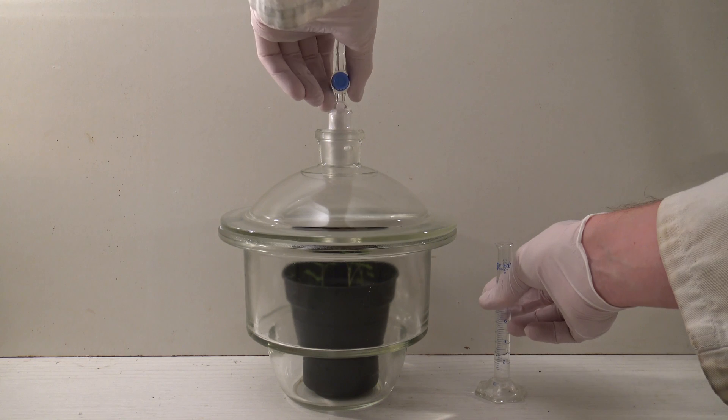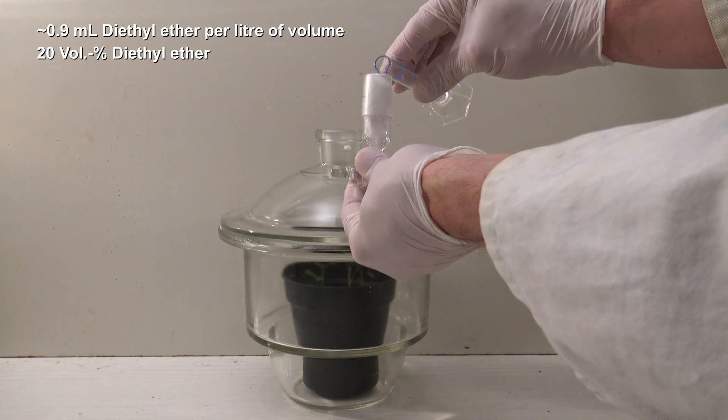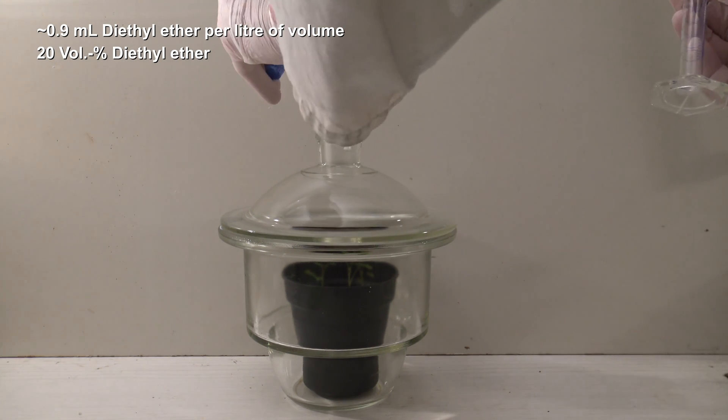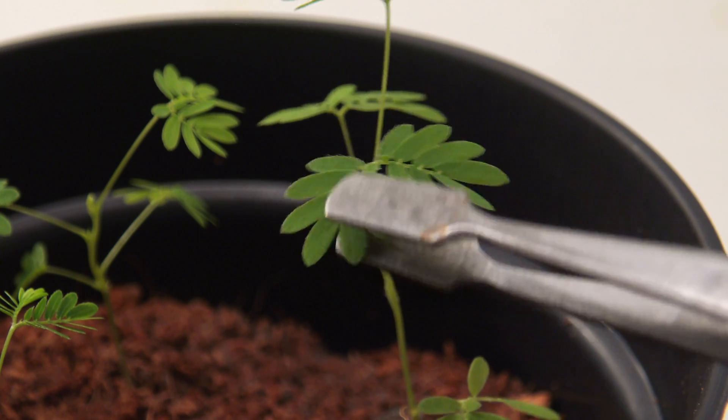That's why the first method was used again and the concentration of ether was increased to 20% by taking around 0.9 ml of diethyl ether per liter of volume. After one hour, the effect was obvious this time.